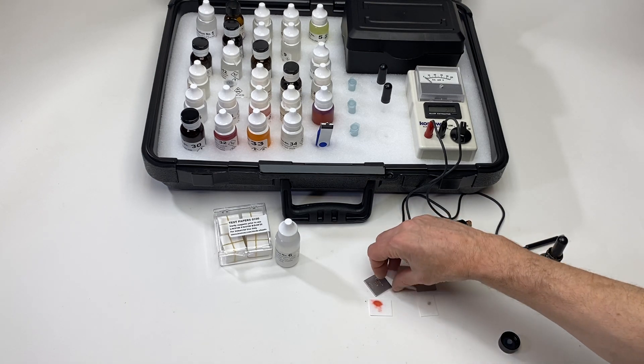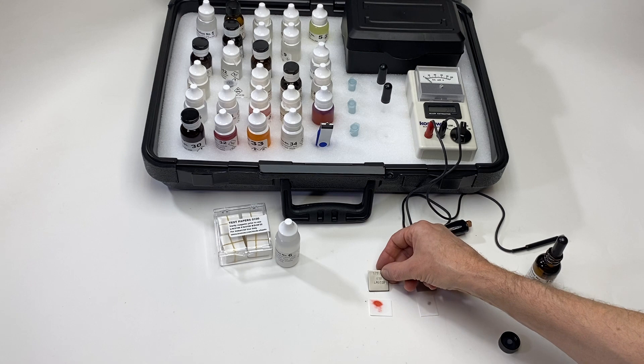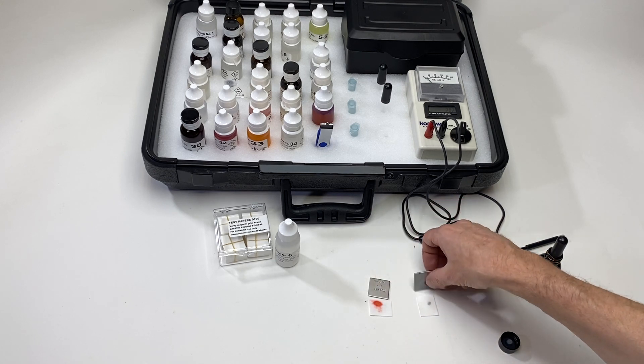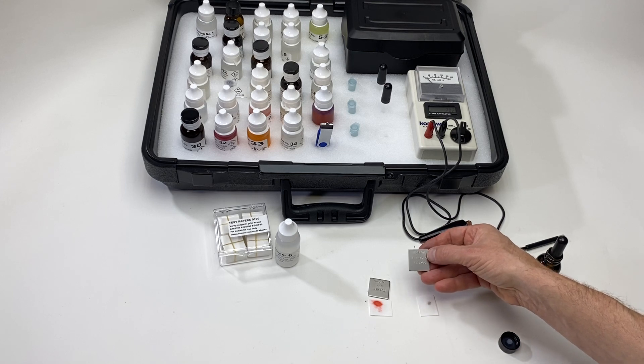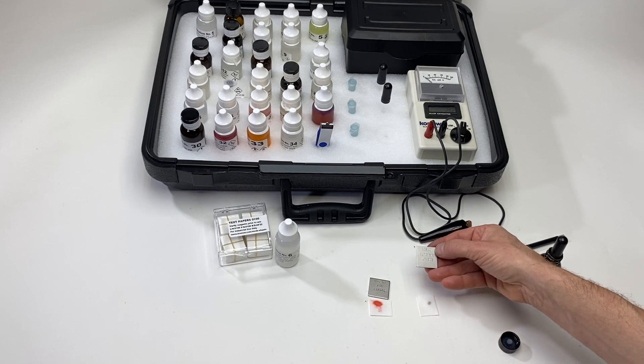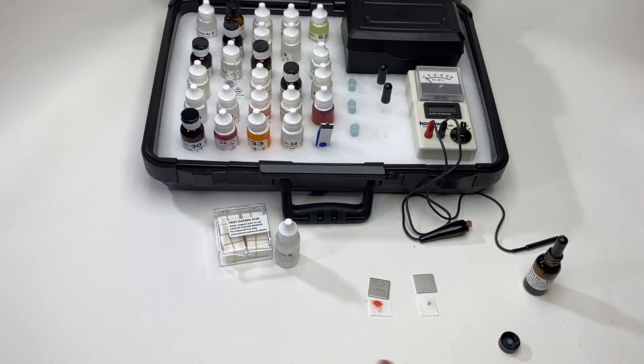Let's see what the metals are since it's written on the back of the metal coupon. This is a 410 stainless steel. And this one is a 7075 aluminum. So it's very easy to tell the difference between something containing iron and something containing no iron.